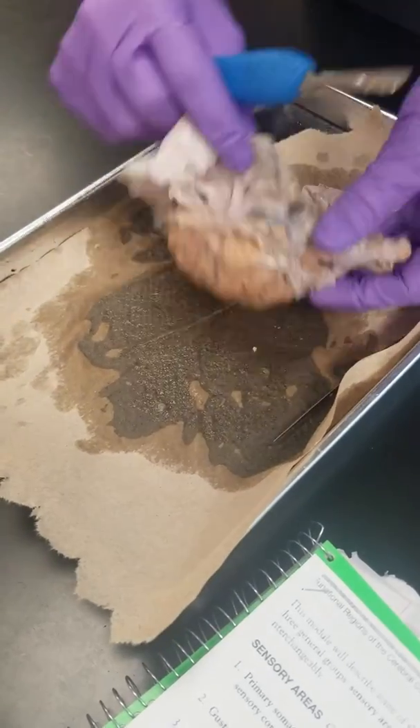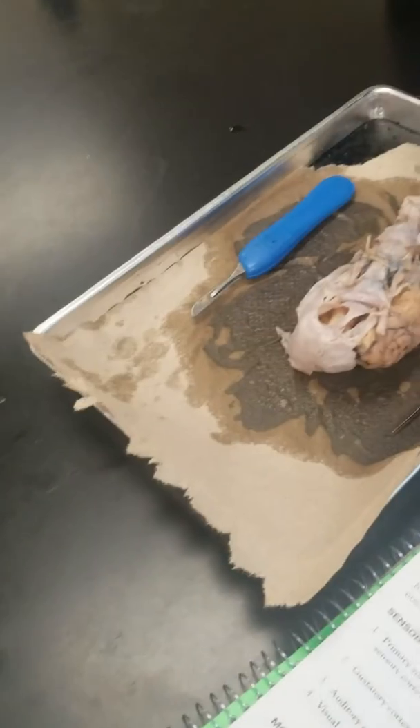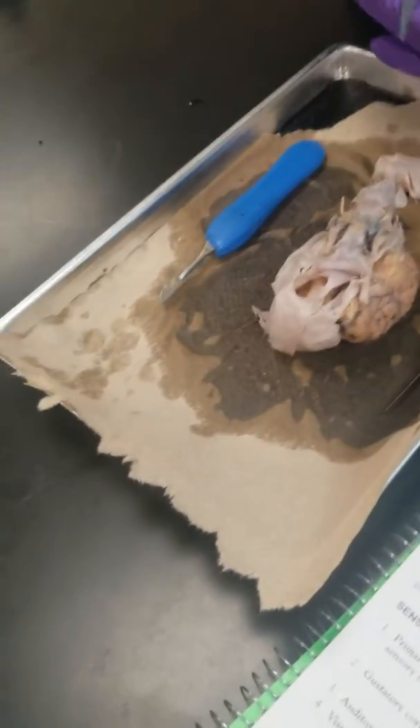I don't want to mess this up — this is a part that's going to mess up. You just take the scissors and you're going to have the dura, the arachnoid, and the pia.